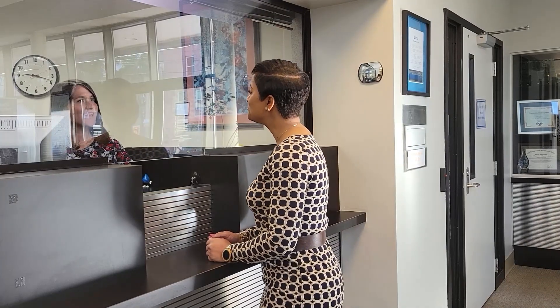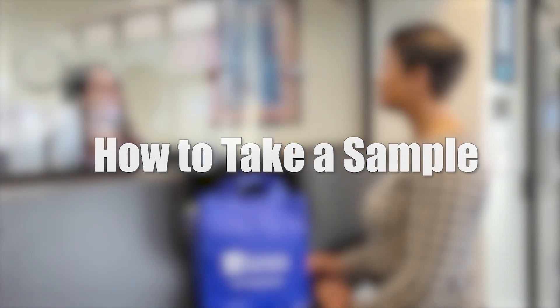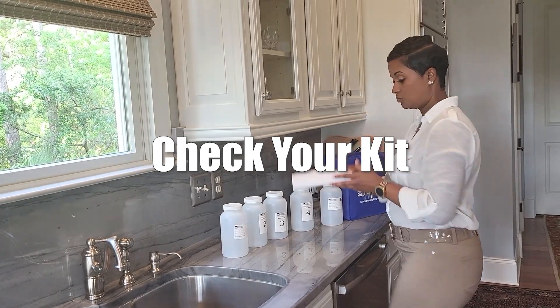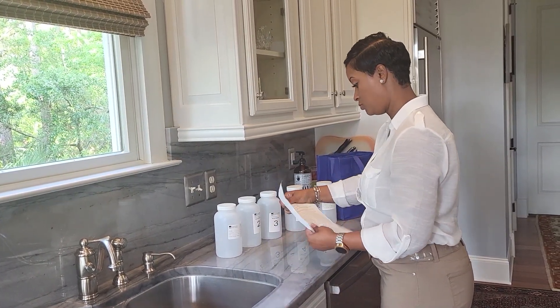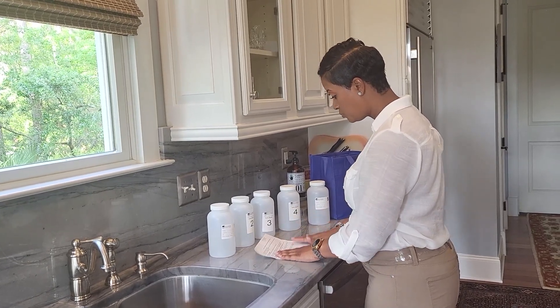Hey there, Charleston Water customers! In today's video, we're going to show you how to properly take a water sample for lead testing. First things first, open and peruse the sample kit that you picked up from a Charleston Water System office. It should contain five bottles and instructions.